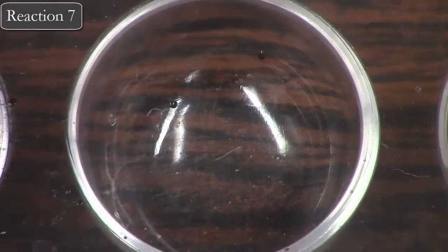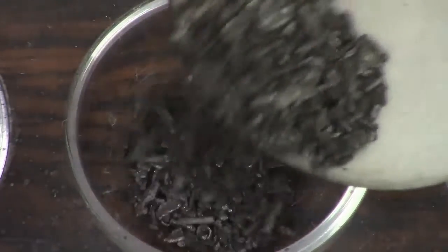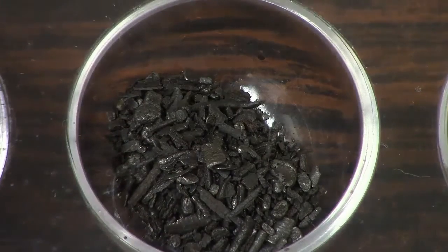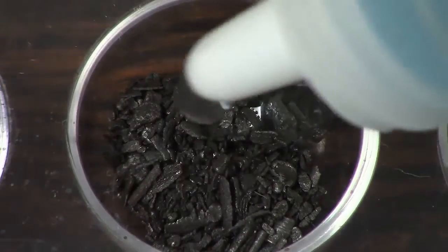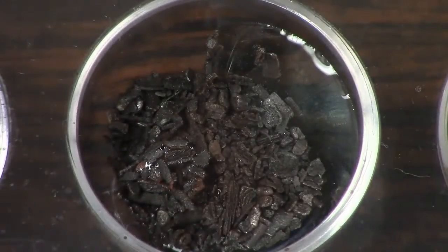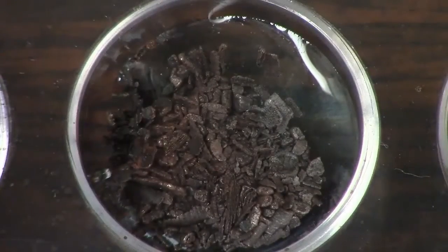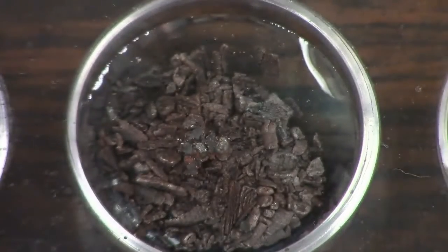All right, now reaction 7. So we're back to using some solids. In reaction number 7, we are going to be taking some solid iron pieces, so that's our iron. And then to that same spot on the well plate, we're going to add a few drops of copper(II) sulfate solution. All right, and then make some observations about what happens when that copper(II) sulfate solution was added to the iron.